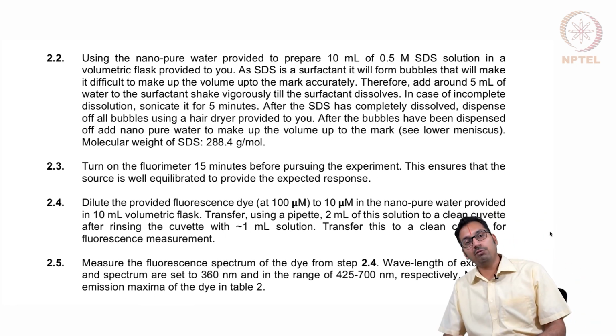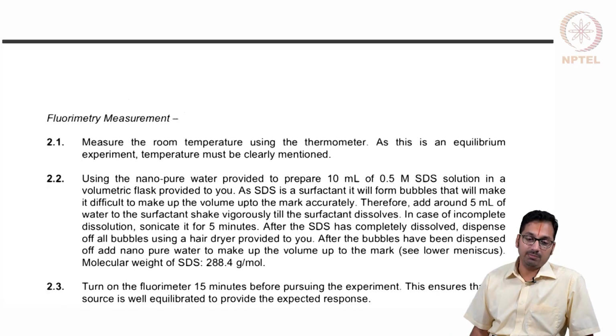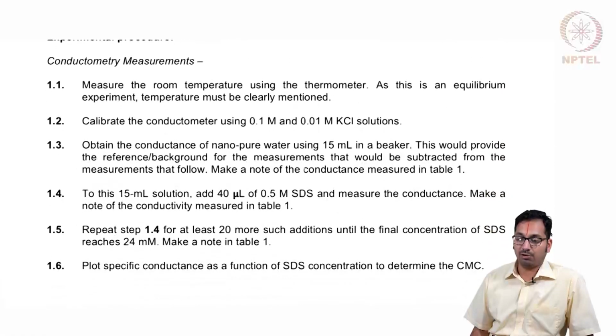So now that we have seen how the fluorimetric experiment works, we also would like to see how the conductometric experiment would be performed. So for this, similar protocols would exist.